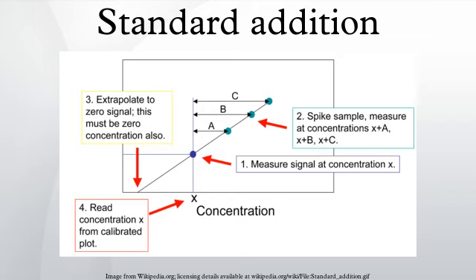Suppose that the concentration of silver in samples of photographic waste is to be determined by atomic absorption spectrometry. Using the calibration curve method, an analyst could calibrate the spectrometer with some aqueous solutions of a pure silver salt and use the resulting calibration graph in the determination of the silver in the test samples. This method is only valid, however, if a pure aqueous solution of silver, and a photographic waste sample containing the same concentration of silver, give the same absorbance values.